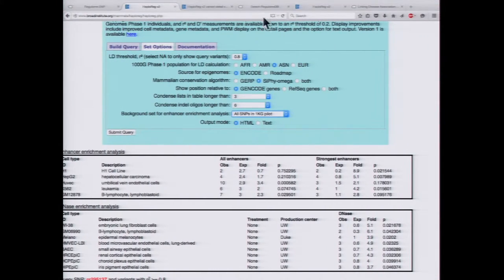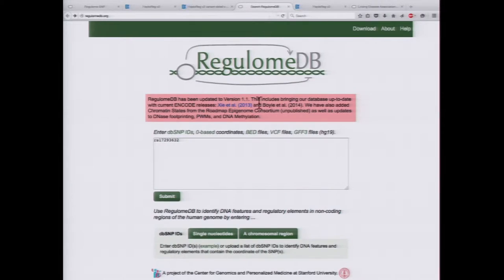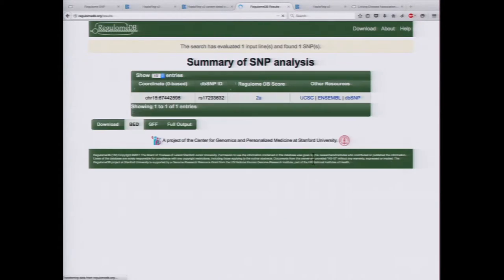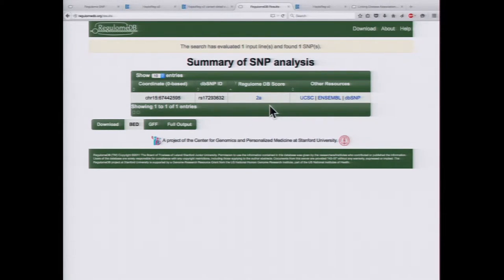What we can do is start with RegulumDB to see what score it assigns this particular SNP. Searching for it, we see that this SNP has a score of 2A — very likely to affect transcription factor binding, which is exciting since it's been found in GWAS and may be contributing directly to disease.